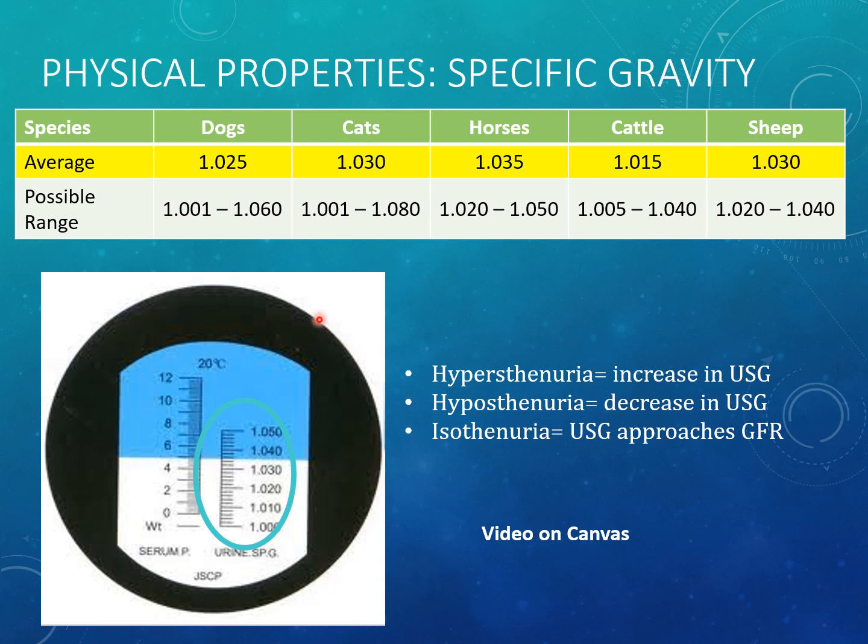So when you look through the eyepiece of the refractometer, this is what you're going to see, this scale inside. There are many different types of refractometers in many different industries, but in vet and med, the two scales that you're going to see inside a refractometer are the SP or TP, total protein, total solids. It all means the same thing, and that's what we read off the PCV tube when we break it in half. And then you're going to have your USG or SG, urine specific gravity, on the right. That scale starts off at 1.000 and it usually goes to 1.05.